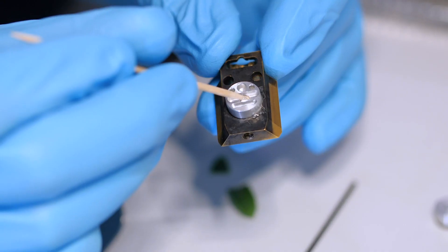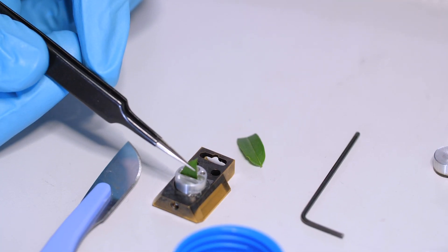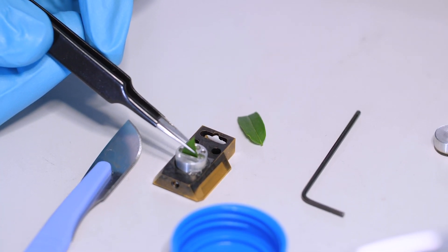He then puts some cryo glue into the shuttle and then takes his cut plant specimen and puts it into the glue.